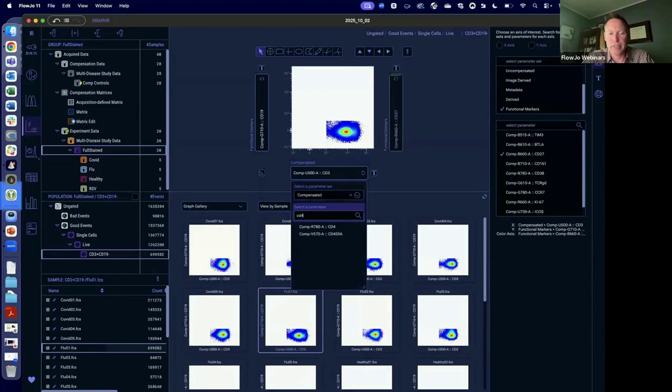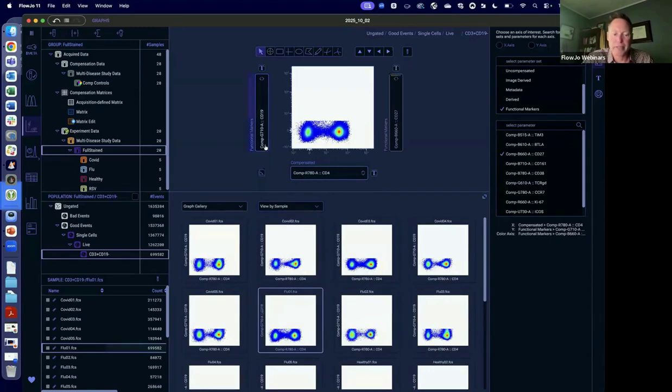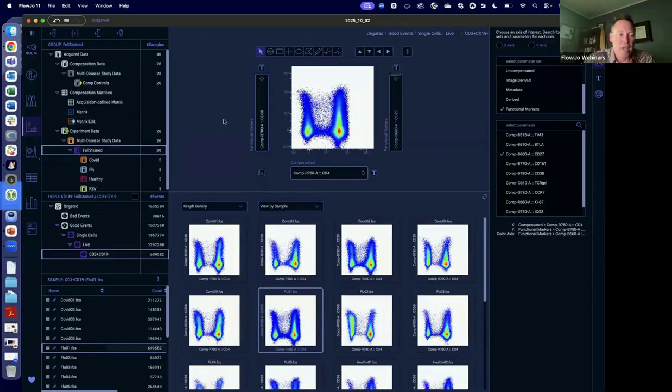Okay, maybe do something like just have a nice picture here for when we do any other kind of drag and drop. All right, cool. So there's that. Let's move on.